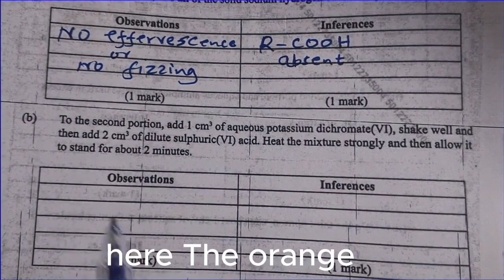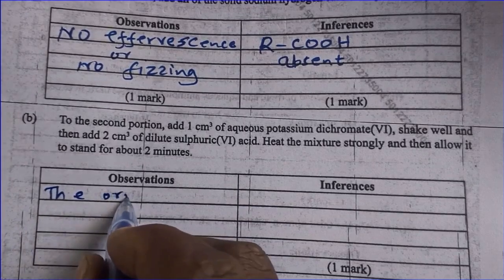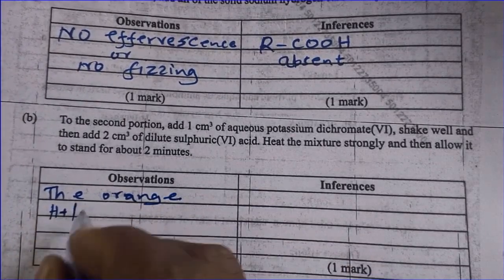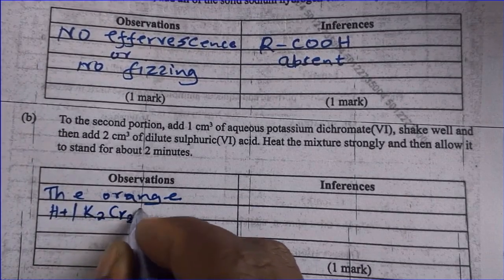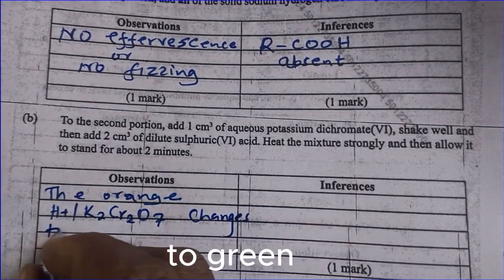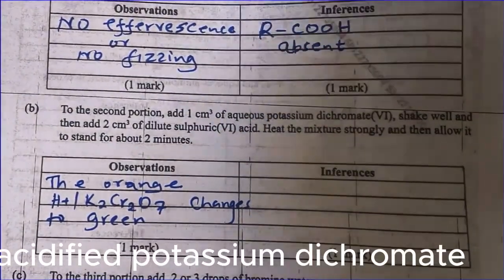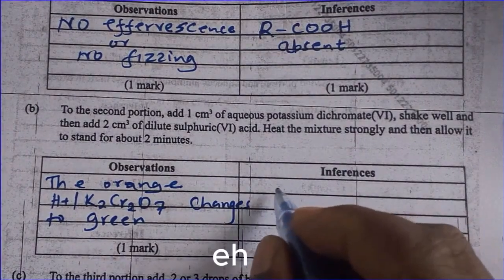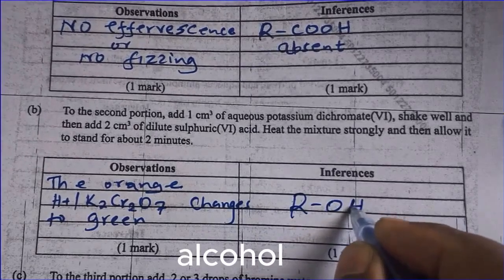Here, the orange acidified potassium dichromate changes to green, meaning that there is what we call ROH, alcohol, present.